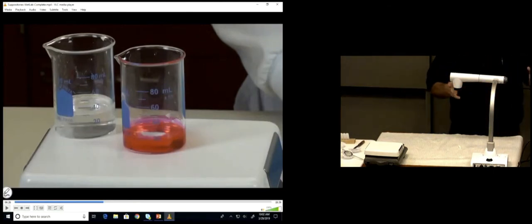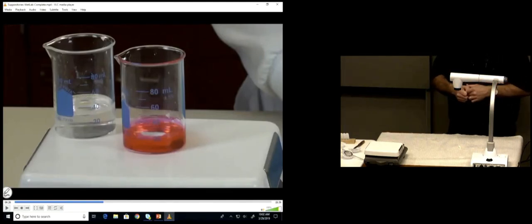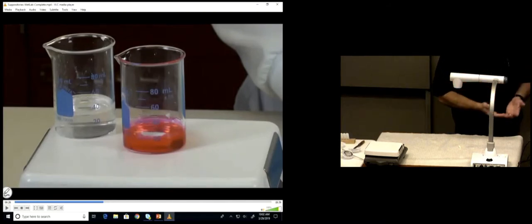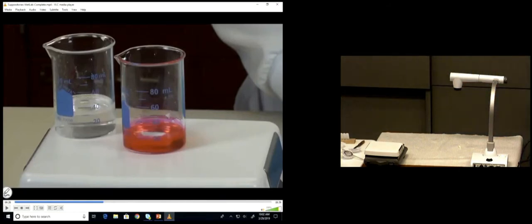And in all of this here, you're fighting time a little bit. This is what I mean by it's a hurry up and wait, because you're going to have to wait for 20 minutes. But you got to kind of hurry up and get there, because as soon as you take that molten base out of the microwave, what is it doing temperature-wise? Cooling, and as it cools, it solidifies, and if it solidifies, you can't add drug or pour the stuff into the mold. So we have to do this part relatively quickly. That's why hopefully you kind of visualize these steps and can progress through them.